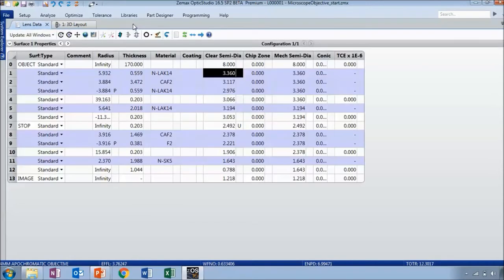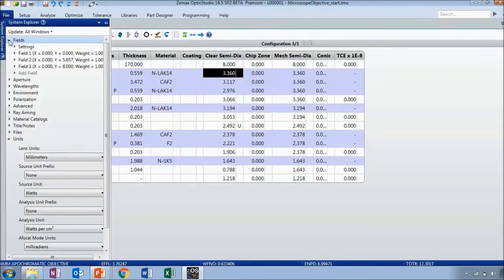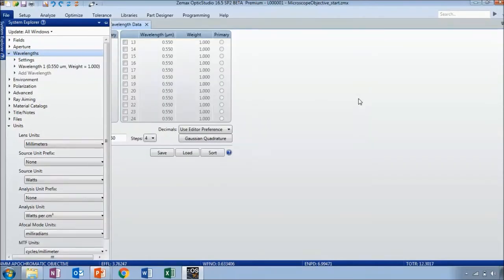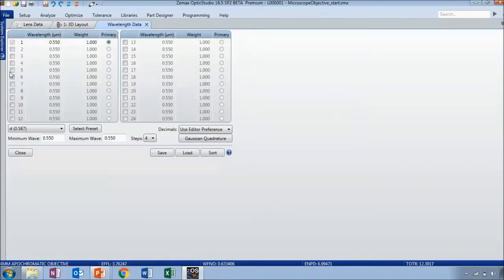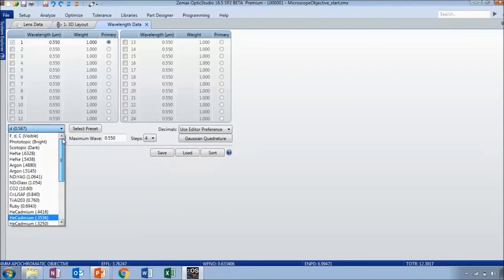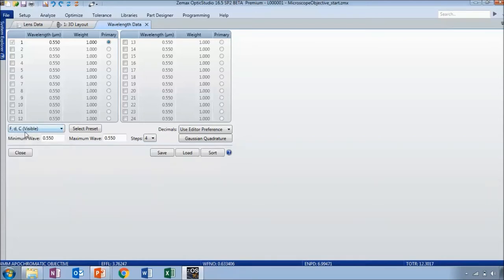I'll close that and now I need to change the wavelengths. I'm going to double click to open up the wavelength data editor. There's only one default wavelength turned on, so I'm going to use the preset wavelengths for the F, D, and C lines representing the visible spectrum. You do need to click 'Select Preset' to push this selection up into your wavelength data editor.